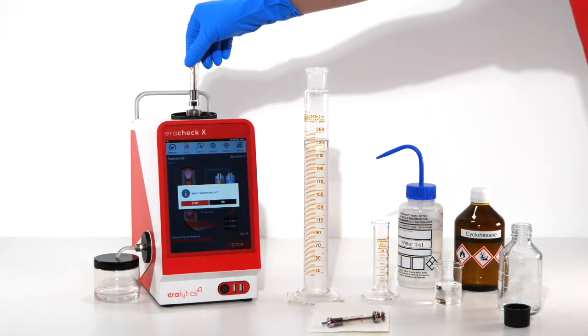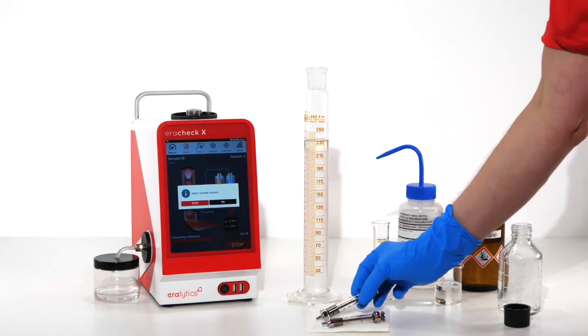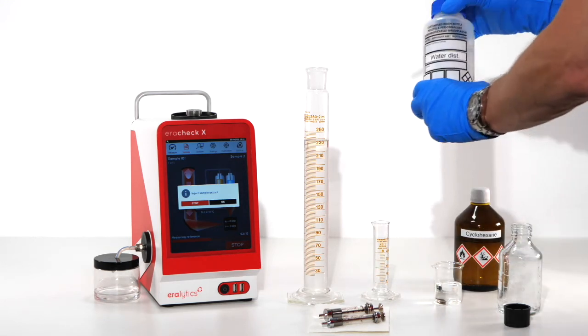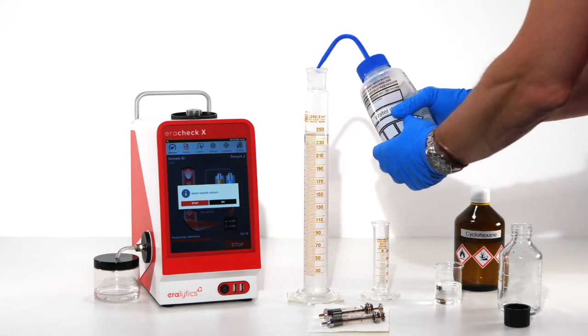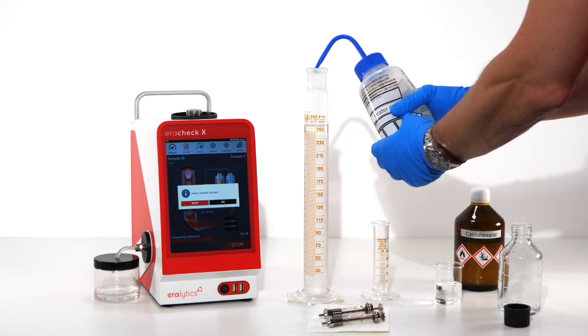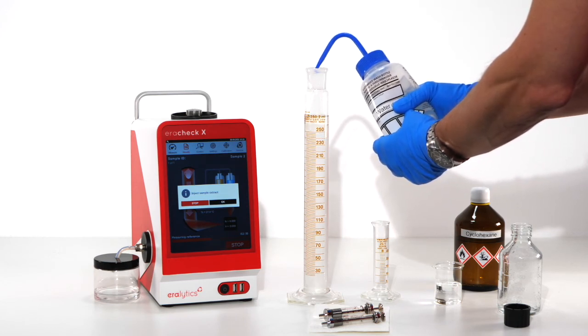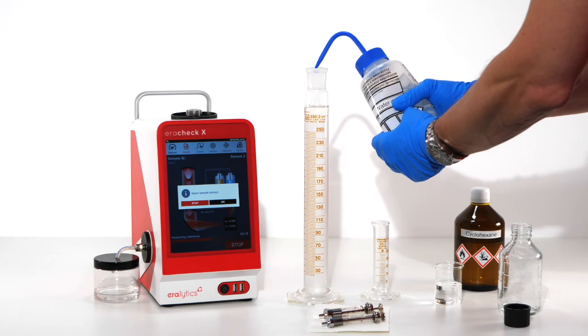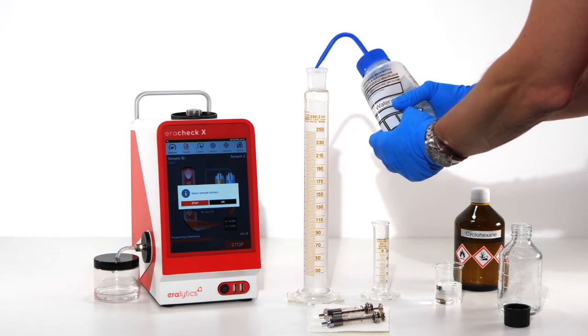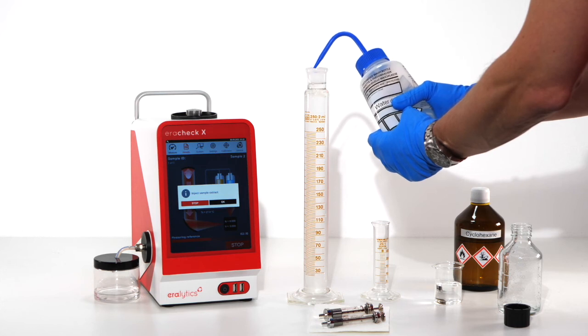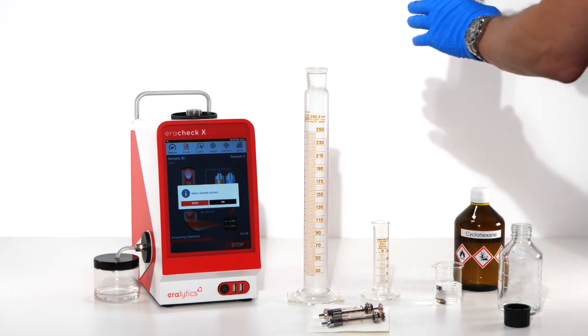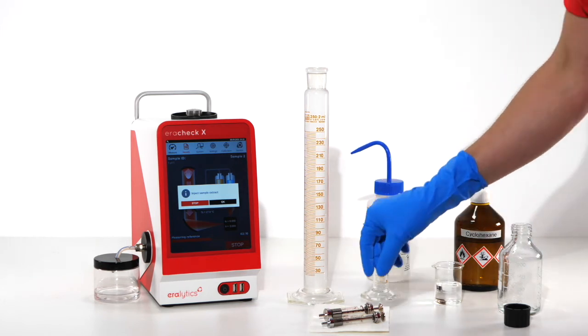Add distilled water until the cyclohexane phase can be conveniently reached with the sample syringe. Extract 3 ml.